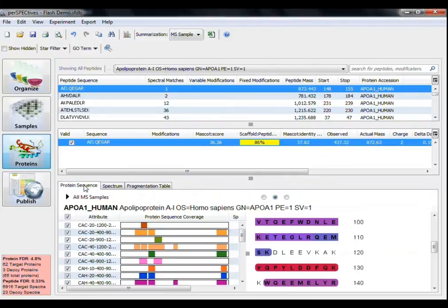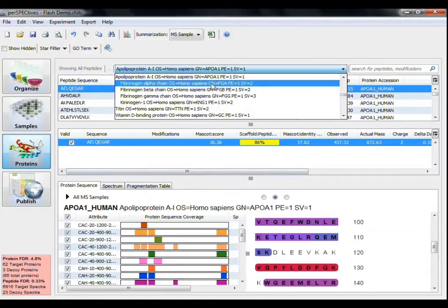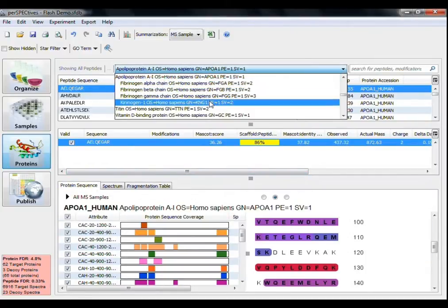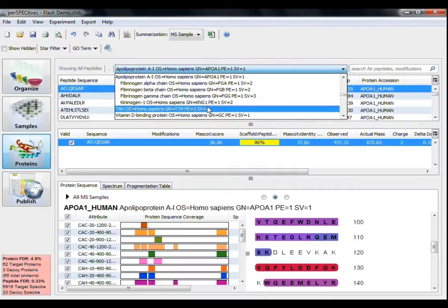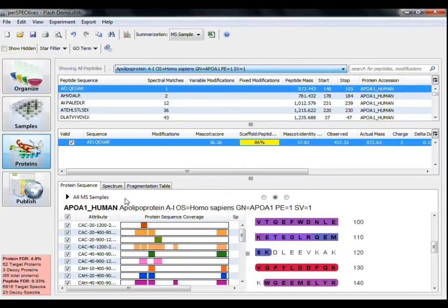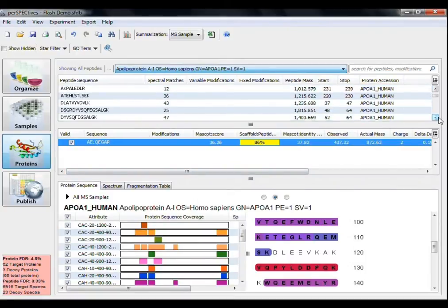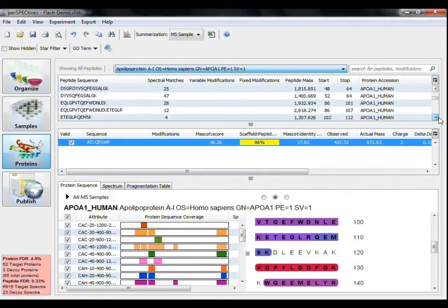Once you select a protein from the drop-down menu above, the Proteins view updates automatically to display the information of that particular protein. I have chosen to examine the protein with accession number APOA1-Human. You can see the list of peptides here, and selecting a peptide will show its identified spectra here.